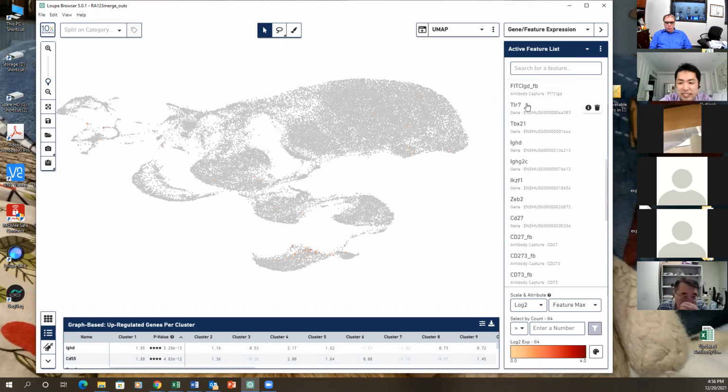Just look at that, because we're highly interested in TLR7. If you just look at TLR7, you see it really starts with the marginal zone and then leads to that. So this is definitely a non-germinal center route of antibody-forming B cell development.